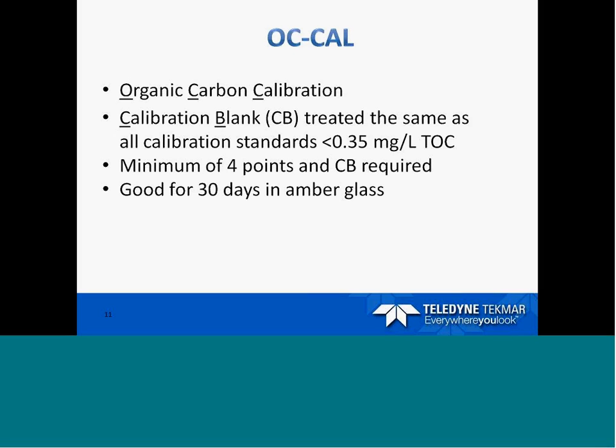This is usually good for 30 days if stored in amber glass or in dark glass. For this note, we ran a total of 7 points. We ran 6 points for our calibration curve plus the calibration blank.